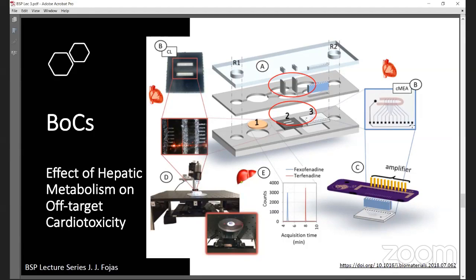So more importantly, let's take a look in detail at the device. So here you have a heart-liver MFD, or microfluidic device, produced with two outer housings of thick transparent PMMA. Like I mentioned before in the previous lectures, there are several other materials that you could use for your microfluidic device. One common one is PMMA, although we've used PDMS for many studies, but PMMA you can also use. And then you have a thick gasket of silicone PDMS sheet material to define your flow path and the positions of your biochips.